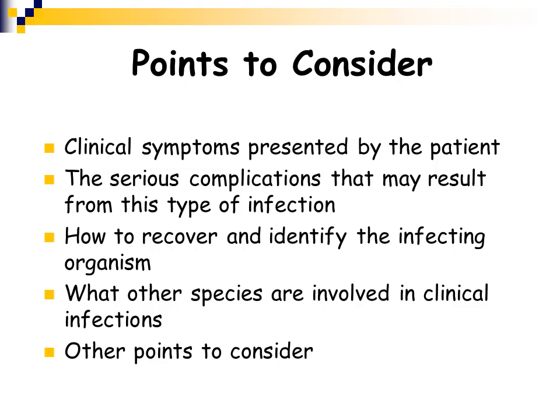So you want to think about how you would grow this organism, this throat culture. You want to streak it out, a streak for isolation like we talked about in one of our first lectures, on a blood agar. You want to incubate in the CO2 incubator. You want to look for hemolysis. Streptococcus pyogenes is a beta hemolytic organism.